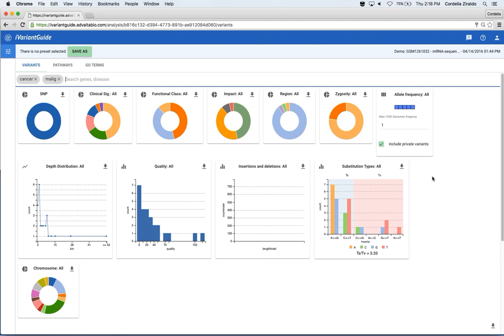And you can see that every time I change a search filter, these graphs update automatically and dynamically, which allows us to see associations that we wouldn't have seen if we had just filled in all of our search criteria at once.